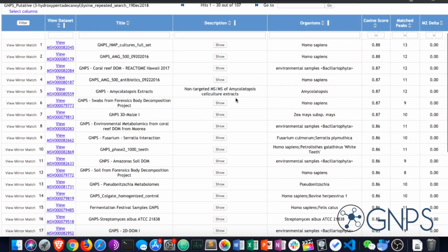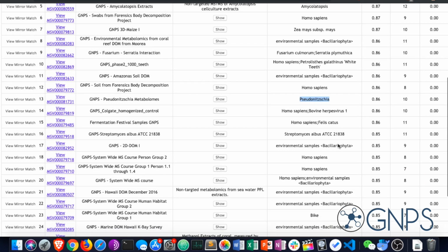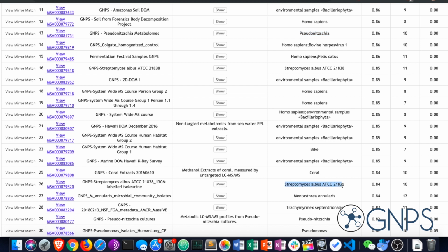However, when we did the search, we found them not only to be associated with the microbiome, but we found that there were many, many different bacteria that can produce these kinds of molecules. They turned out to be very common throughout environmental microbes, ocean microbes, soil microbes, as well as the human microbiome, rat microbiome, etc. To me, this gives a better overall picture of the distribution and the presence of these kinds of molecules.